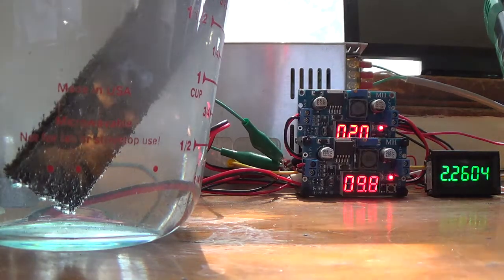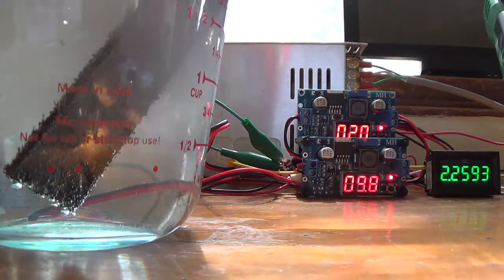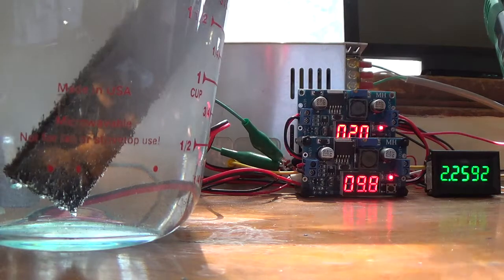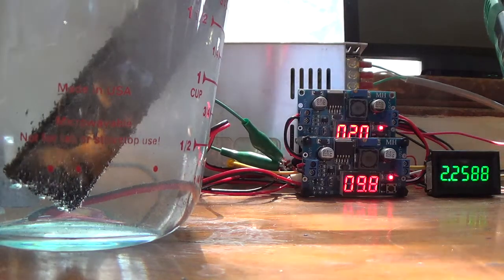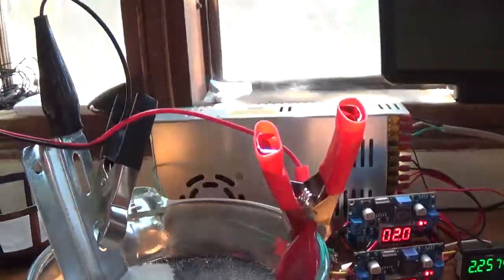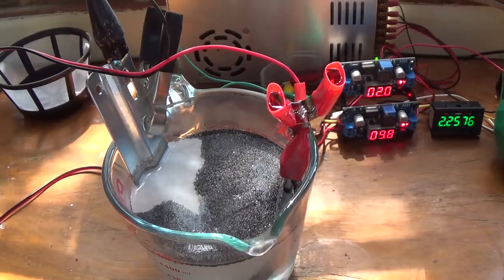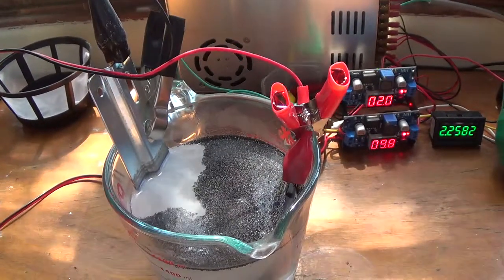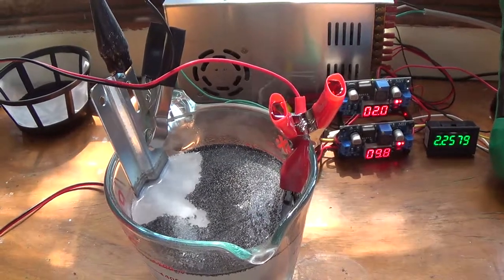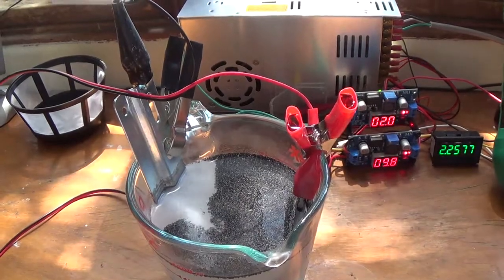As time goes on, I'm probably going to start decanting the raft of graphene nanoplatelets. In fact, I'll go ahead and move the camera to see. There is the raft. That's very interesting how much gasification we're seeing off of the electrode, the cathode.